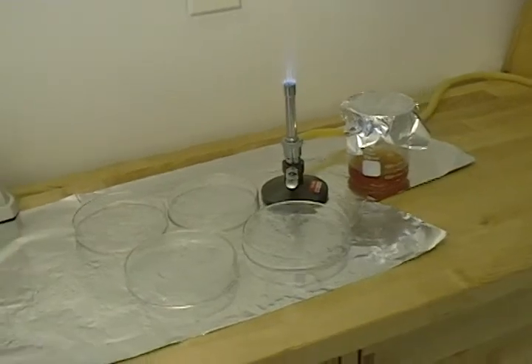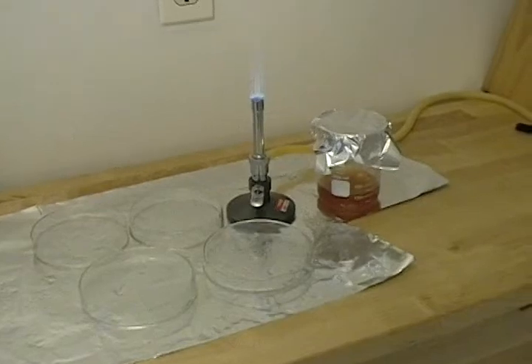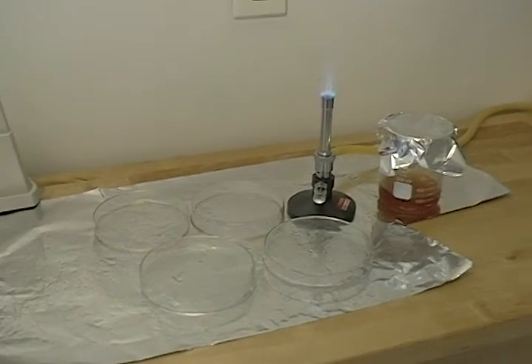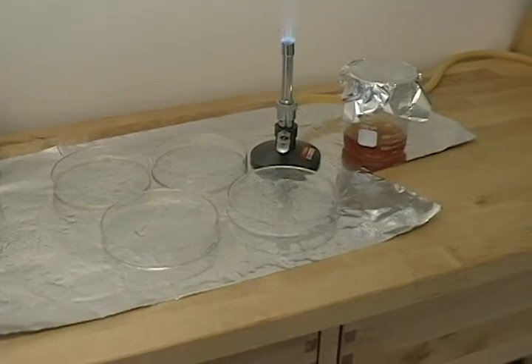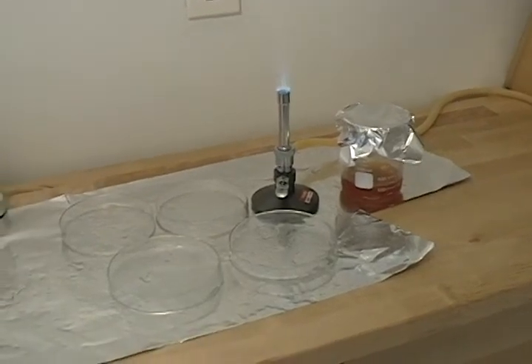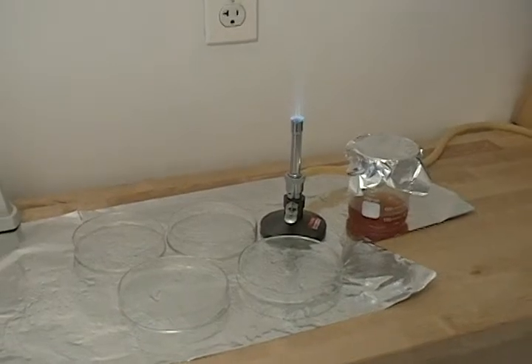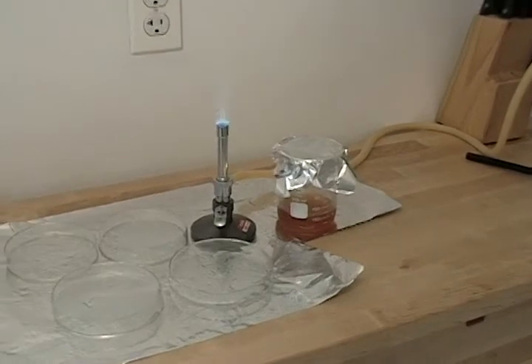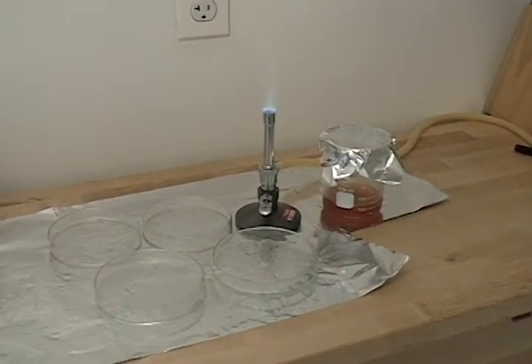Now everything is out of the improvised autoclave. I've set up a sterile work environment here with the Bunsen burner, which provides an updraft so anything near the flame floats upward instead of onto the sterile items below. I've covered the sterilized wort with a piece of sterilized aluminum foil so it can cool a little before we pour the plates. Basically, wait until the wort is cool enough that when you touch the glass to your cheek it feels warm but doesn't burn. Then the plates are ready to pour.